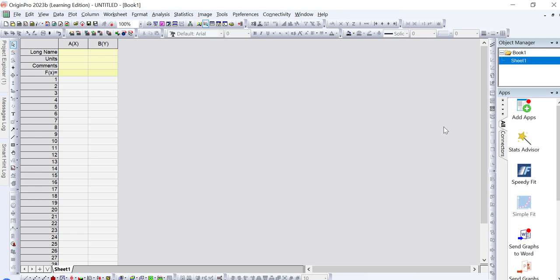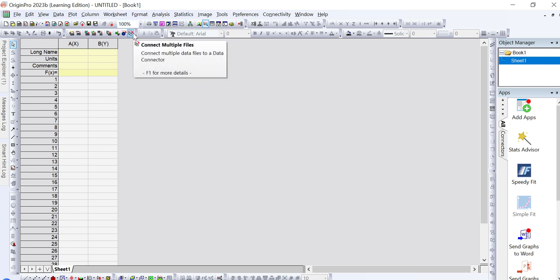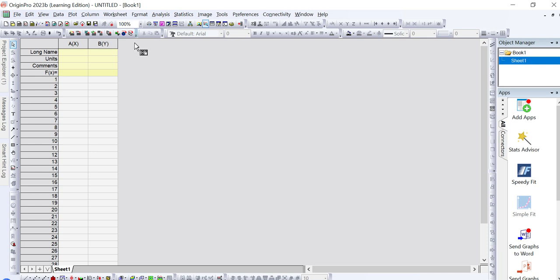In order to plot such a graph showing two different processes, we need to add data for both before and after the process. For example, if you are studying adsorption of any pollutant, degradation, or any other process, you need to add wave number in the first column, your data before treatment in the second column, and your FTIR data after treatment in the third column.